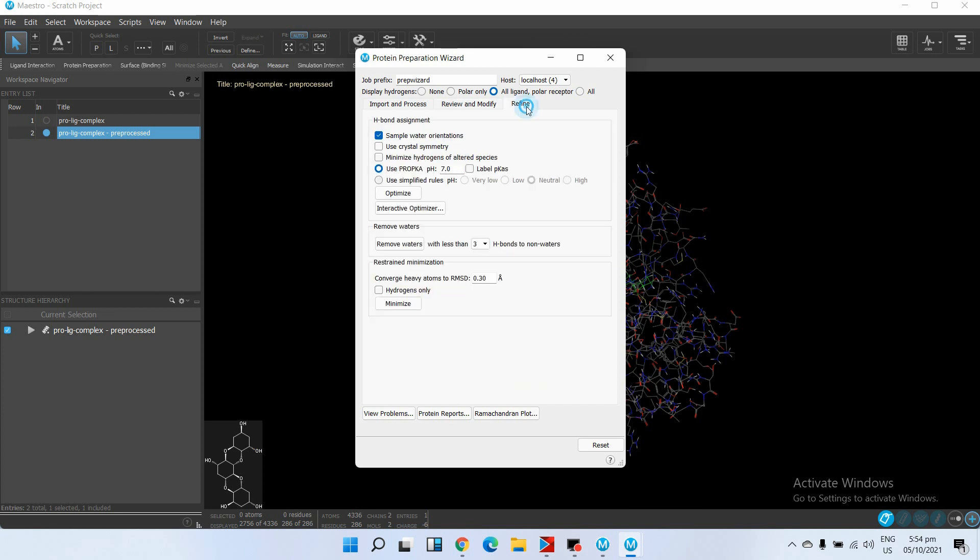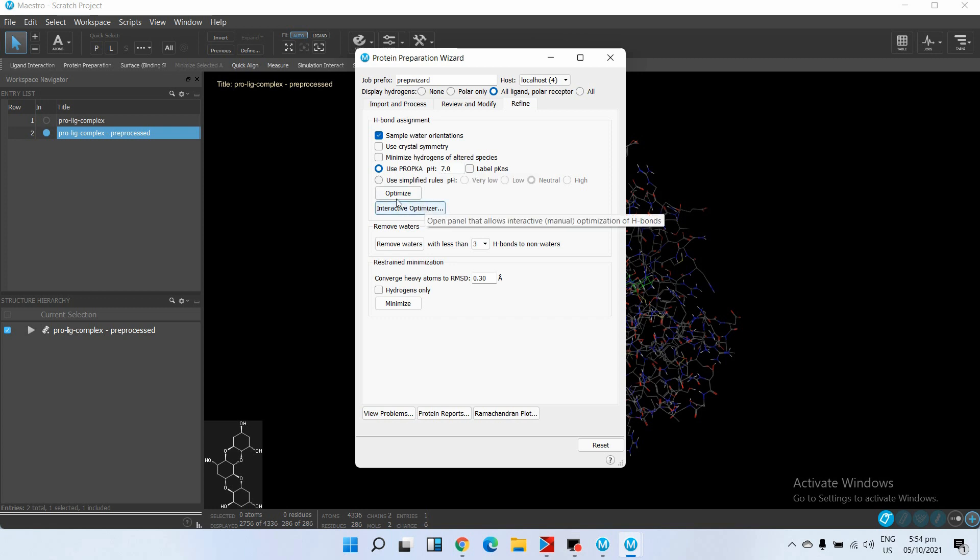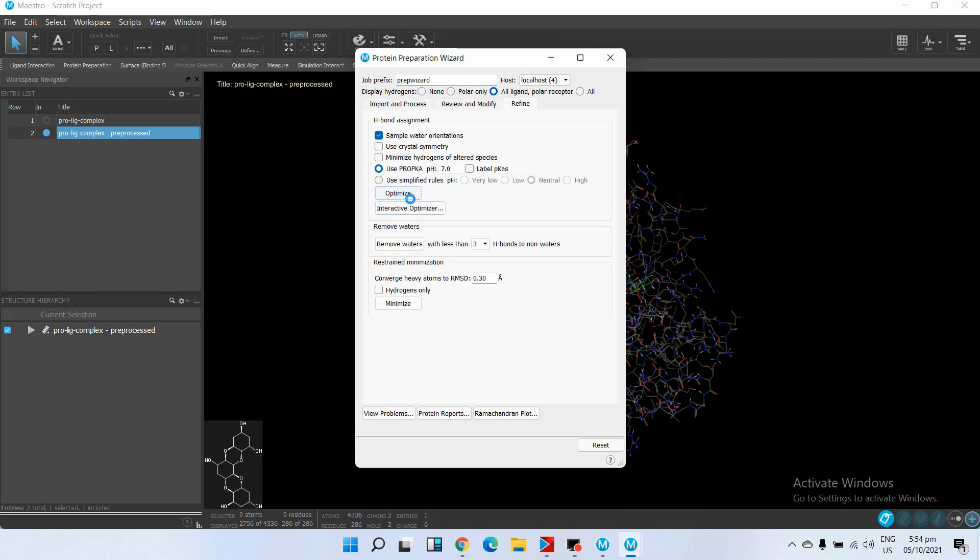Now go to Refine. We will use the default parameters, but if your protein has different pH other than neutral pH, you can change the pH for its pre-processing. Just click on Optimize.